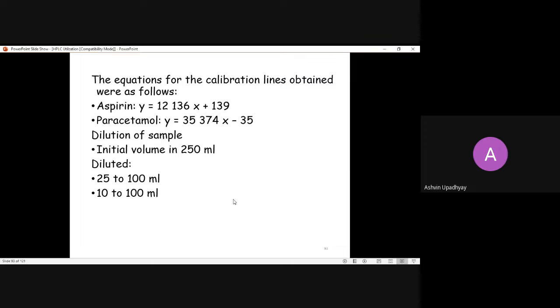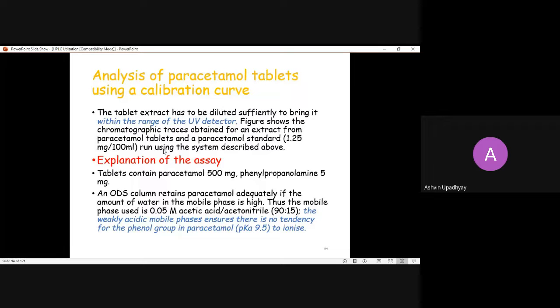and direct calculation also you may calculate by establishing the equation, the area of sample divided by area of standard multiplied by dilution factor, and vice versa, the sample concentration, the potency. Okay, this is the dilution, whatever you consider for the preparation of the sample.